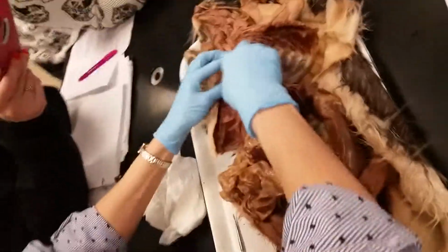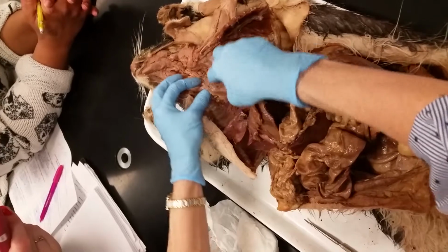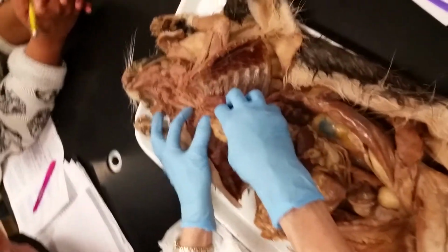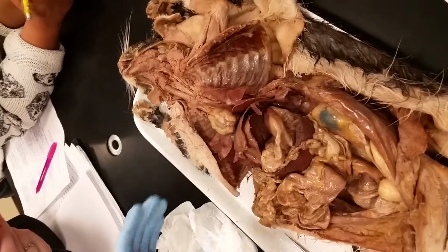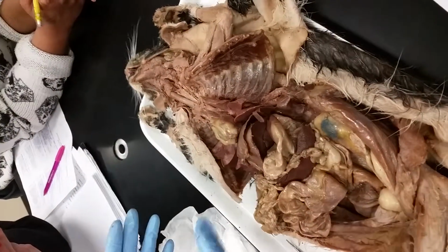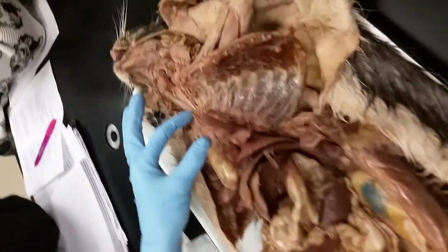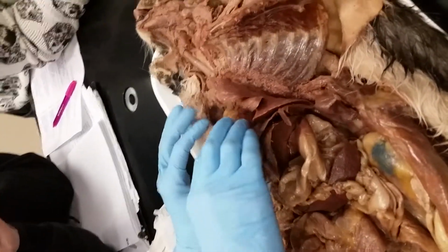I don't know how much of this is actually thymus gland and how much is fat in this one. I suspect most of this is fat. But if this had a thymus gland, it would be right here. It's really dark red glandular tissue. But as you age, your thymus gland gets reabsorbed because you don't use it anymore, in us and in cats. So this is an older cat. If we had really young cats, you would see this nice reddish-colored gland right there. Okay, so that would be the thymus.